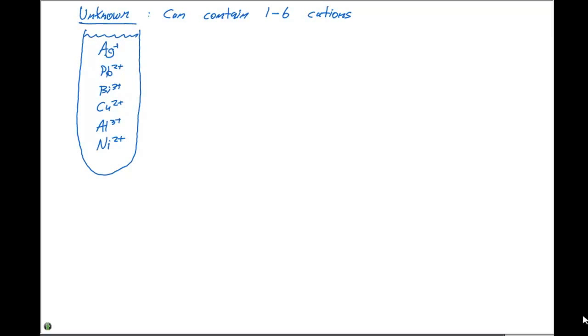So we're first going to give you a known solution and tell you to go around and play and observe. The narrative for this particular lab is very, very, very important because you have to be able to write down the colors that you observe. So for example, if you mix 2 solutions together and it will say you're going to observe a precipitate, be sure to note the color, you need to be able to write that down in your notebook so when you see that again, you'll be able to identify the same thing. Okay? After your 3 labs, you're going to get a lab practical. And that lab practical is going to be the unknown. So make sure in this particular lab you keep very, very good observations.